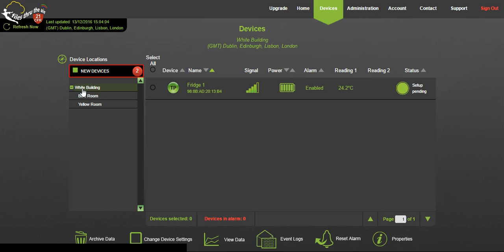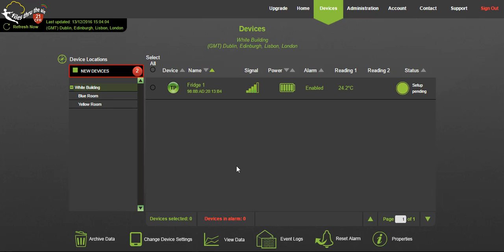Devices assigned to the location can be seen on the right. This shows the type of devices, their names, signal strength, whether they are battery or mains powered, if any alarms have been set, the current reading, and the status wheels which represent when the next data transmission will be made. Devices in alarm are indicated by the red alarm icon.